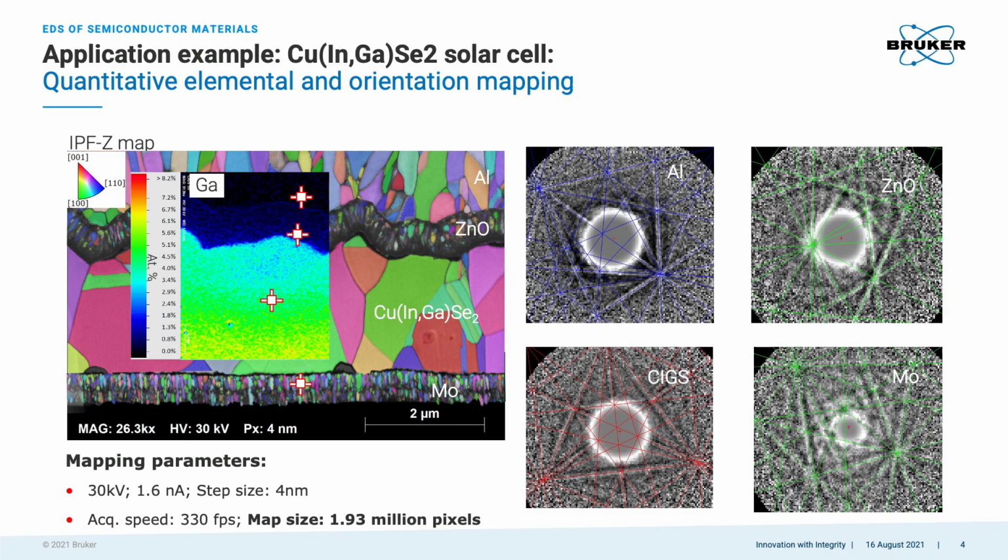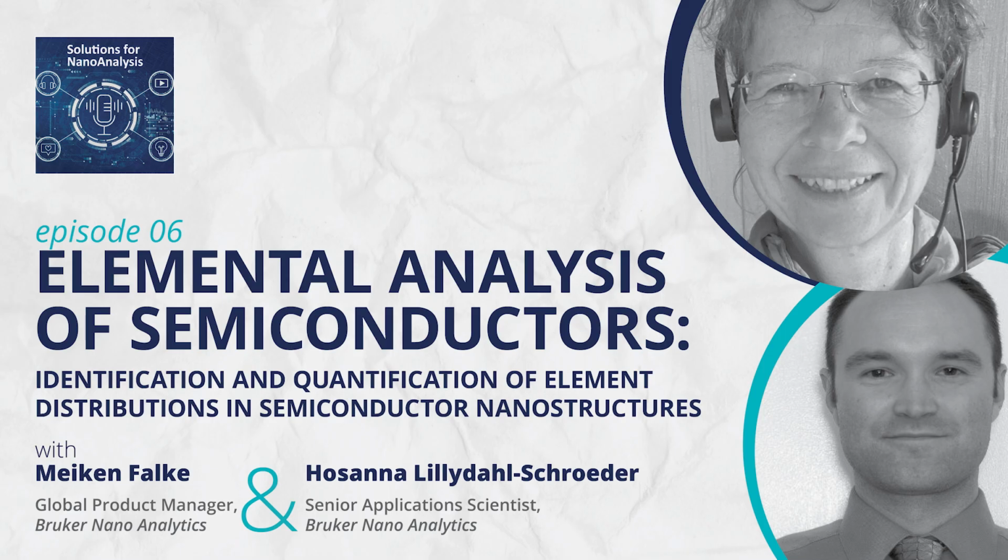Maybe we should talk about that now. What do you think? Sure. So as far as these different sizes and types of detectors, what sort of timescales are we talking about as far as data acquisition and time for analysis, that sort of thing? Yeah, I like to explain things so people can imagine, not just give numbers. Acquisition times reach from hours to seconds. That is not very informative.